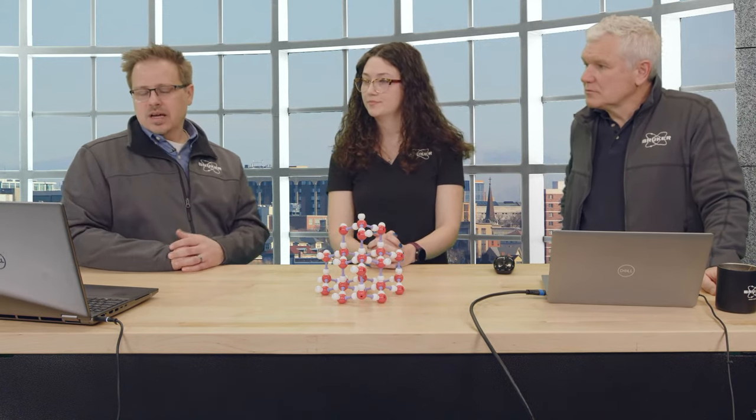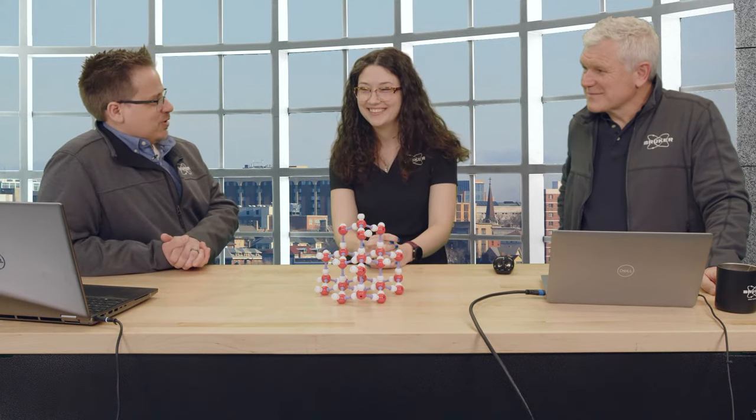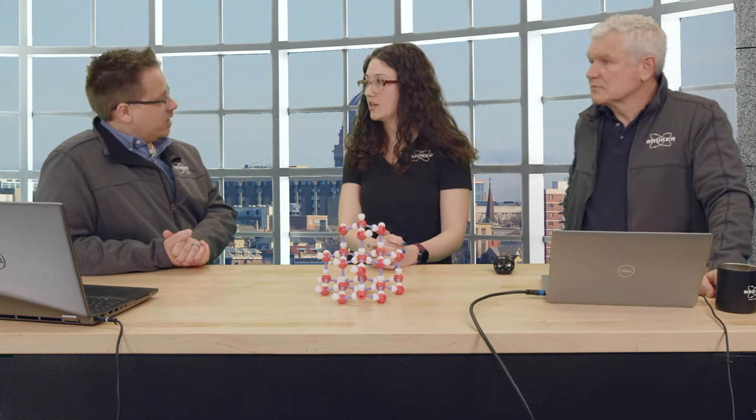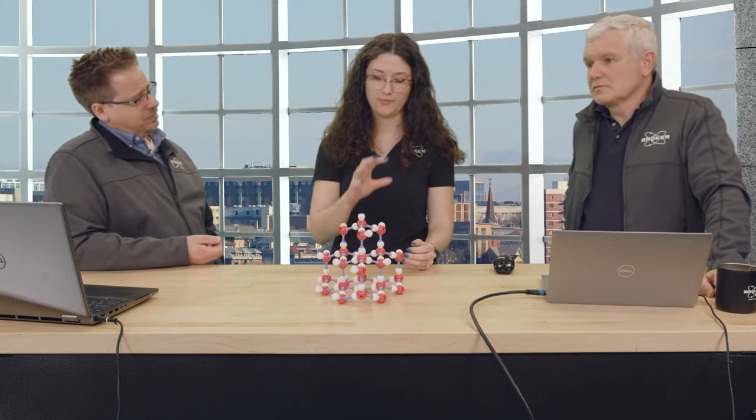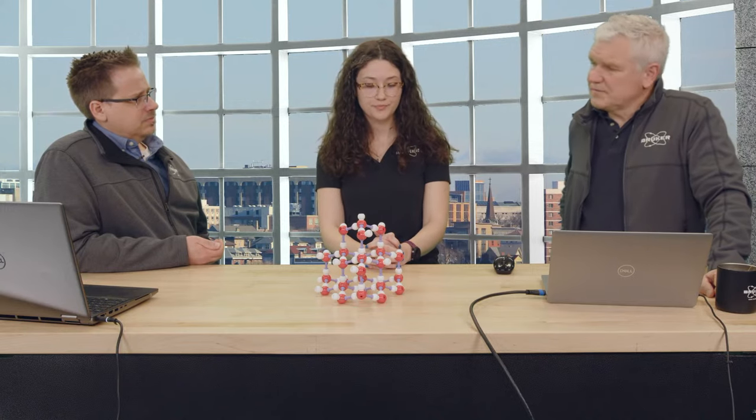Next question from Taylor: can Apex 5 read other frame formats? We can read a lot of synchrotron data sets. There are some ways you can change the format to something compatible with Apex, but there are some limitations. Most of the synchrotrons, basically everything that can write a CBF file, which is the general exchange format, and most synchrotrons will do that because most synchrotrons use Dectris detectors.